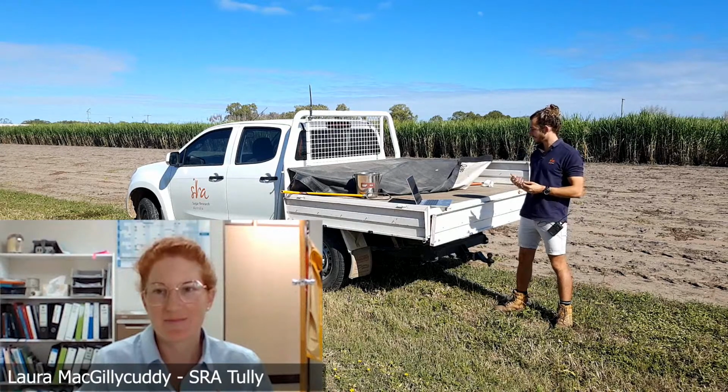So I'm joined now by Laura, who's up at the soil assay lab up at Tully. So thanks for joining us today, Laura. You're welcome. So what testing do you do up at the soil assay lab? So here in Tully, we do 2 tests. We do the Pachymetra test, and we also do the nematode test. And in that, we do the parasitic ones, the bad ones, and we also do the free-living ones, the good ones.